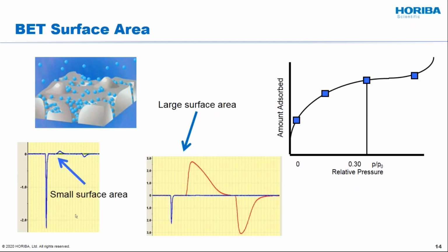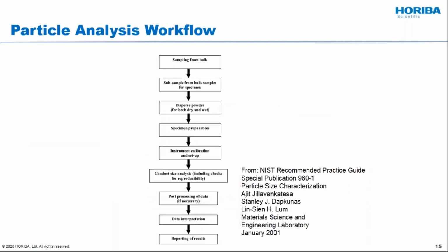because it is one of the subjects that comes up in one of our later webinars. Now, one of the things I wanted to introduce to you here is what is going to be involved in getting your sample ready to be analyzed and to report the data. You can see we've taken this from a publication that came from NIST, and this gives you a very good idea of the challenges.